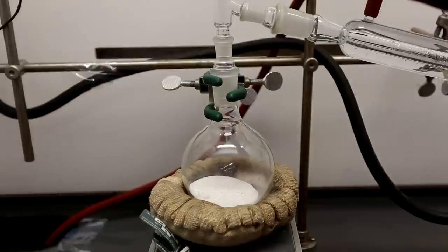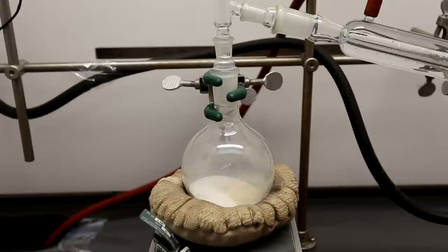The stopcock is open and the sulfuric acid is added to the anhydrous sodium acetate. You should notice immediate bubbling and the production of white fumes. This reaction is extremely exothermic and it can produce enough heat to almost boil itself on its own.